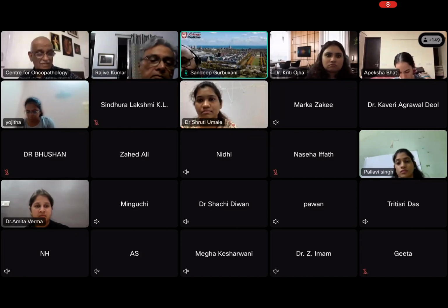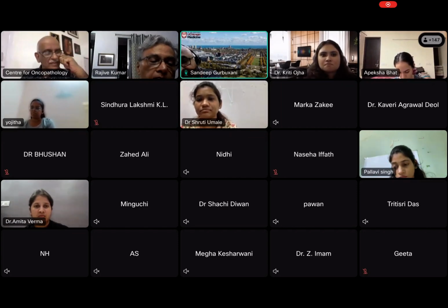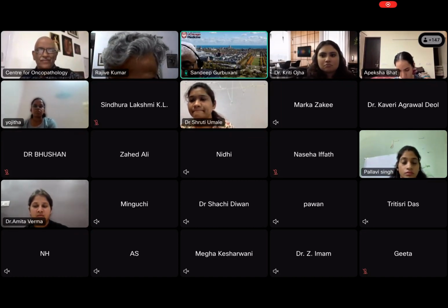And there is another number that you need to cross the threshold for. You have to examine 30 megakaryocytes, and 3 out of 30 have to be abnormal. You can't make an assessment on less than that. And sometimes you don't have enough megakaryocytes, and it becomes challenging. But don't overcall dysplasia, especially in megakaryocytes, and even more on biopsies than an aspirate, where things can get cut in a plane where it looks like the lobes are separated or there aren't enough lobes. So be very careful in calling something dysplasia.